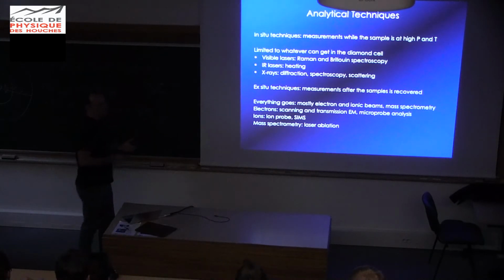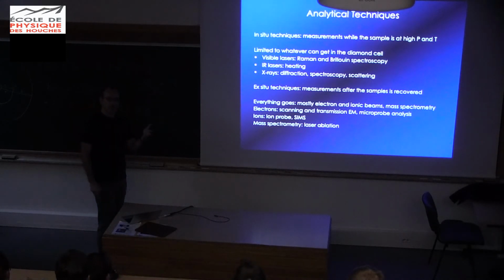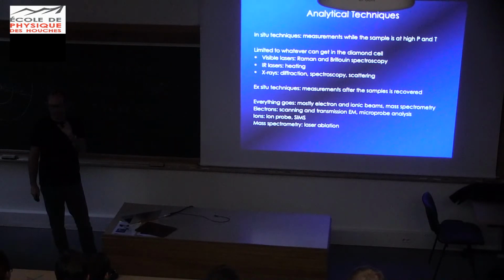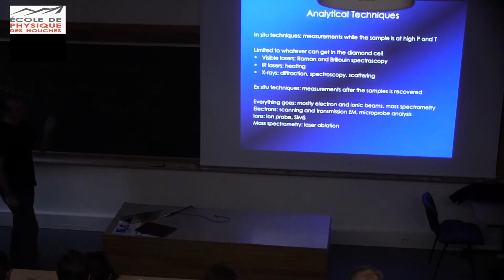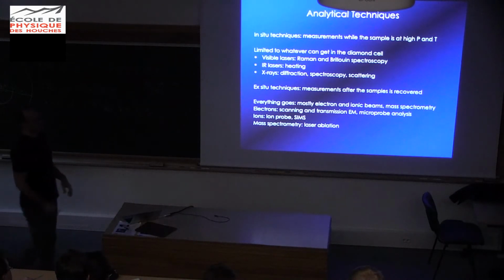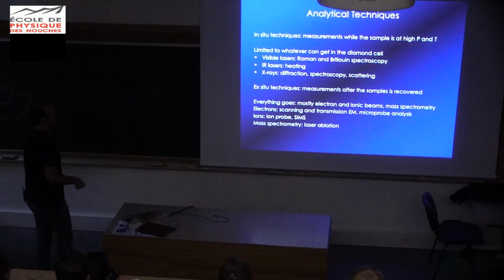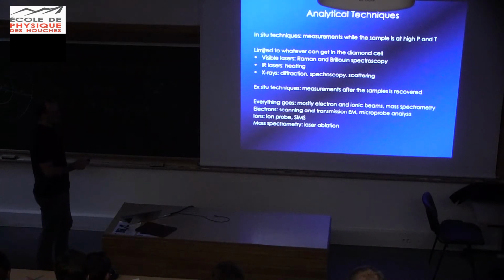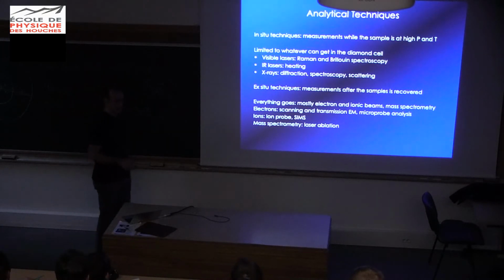So the in situ techniques are mostly diamond cell techniques. There are some in situ techniques on piston cylinder, on multi-anvil, and other types of cells called Paris Edinburgh, but these are niche sort of things. Most of the in situ work that you see nowadays in the high P and high T world comes from the diamond cell. And it's basically limited to whatever it can get in the diamond cell.